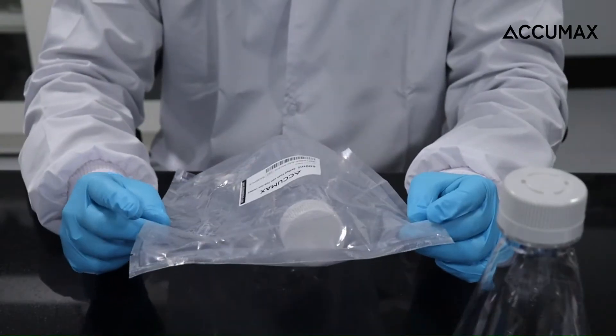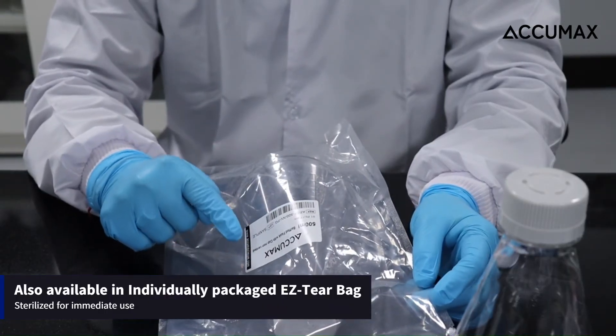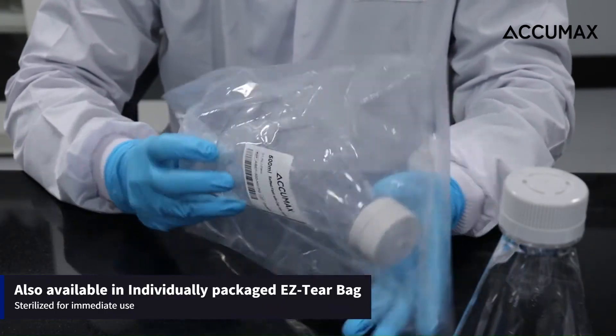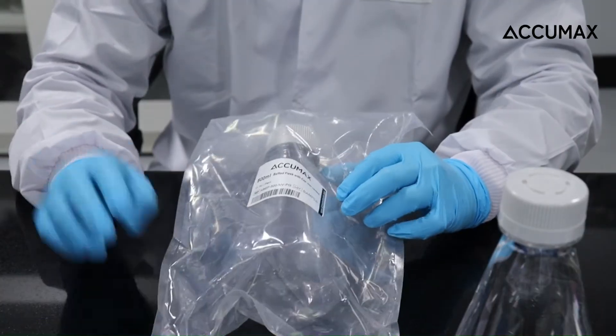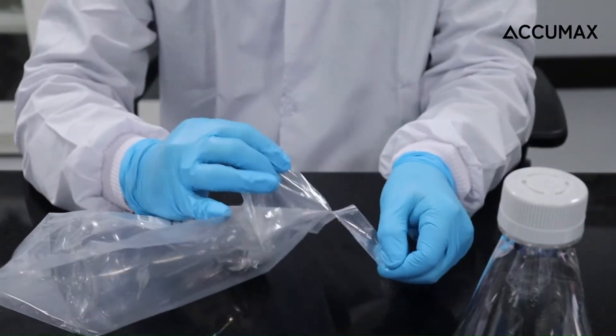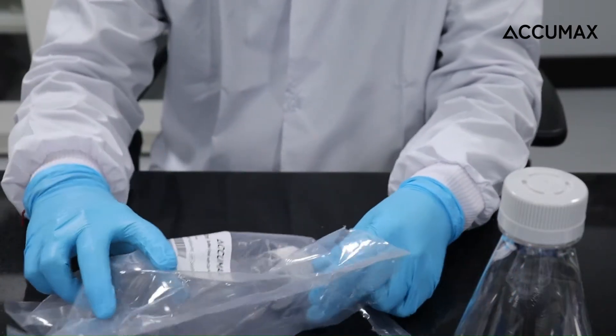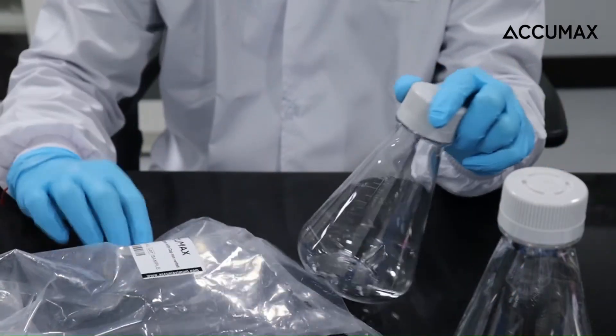These flasks are also available in individually packed easy tear bag, sterilized for immediate use. As you can see, this is an easy tear bag — I can easily tear the bag from here. This is an individually sterile bag and it's a very easy tear.